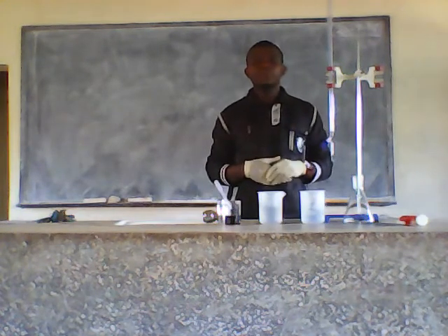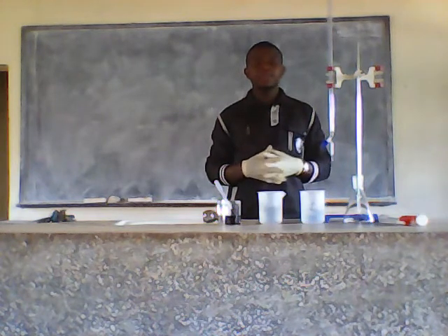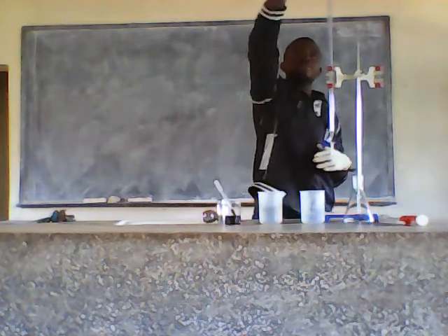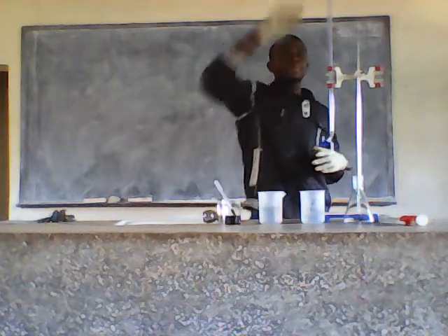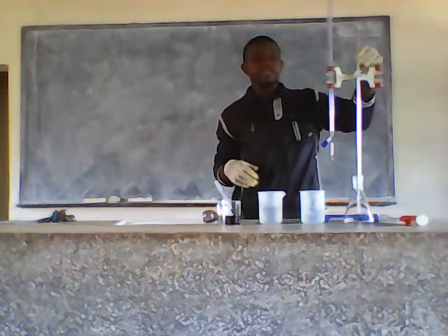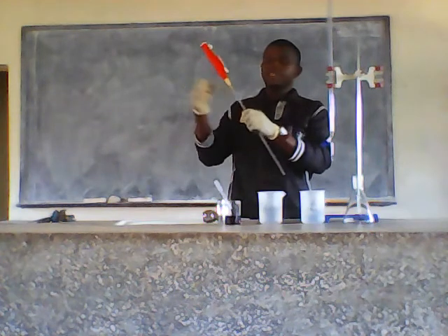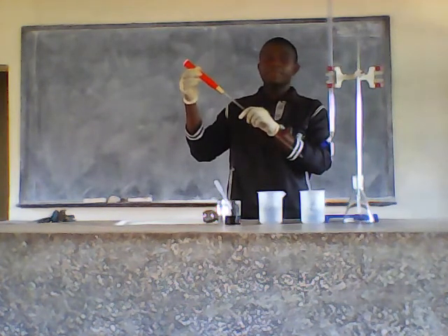I'm going to do an experiment on titration. To carry out this experiment, I have some materials that I'm going to use. I have a funnel, then I have the burette, then this is the clamp stand. I also have the pipette — this red thing is the pipette pump.